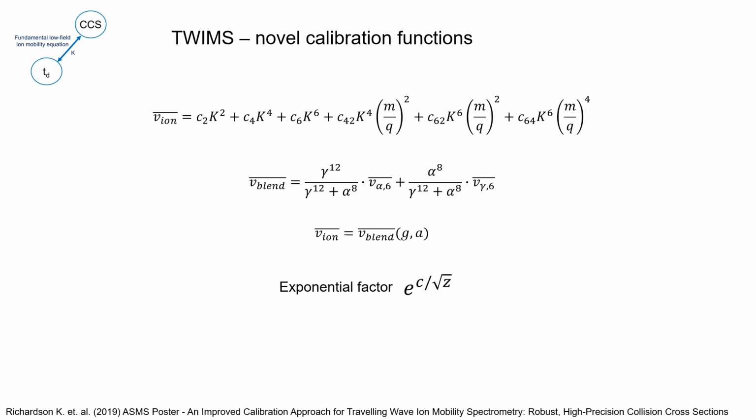And for cross-validating this new approach, they have used quite a wide range of compounds, including lipids, peptides, native and denatured proteins, which unfortunately make this method impractical for routine analysis due to the long experiment time to prepare the calibration mix. And now the challenge is to find a stable calibrant mix, easy to prepare, that can be used for ideally any analyte. And this requires further developments and testing, and I think it will require some more time, but I also think that we are going towards the right direction. And this method is still in development, and I can't wait to experiment this new calibration approach myself.